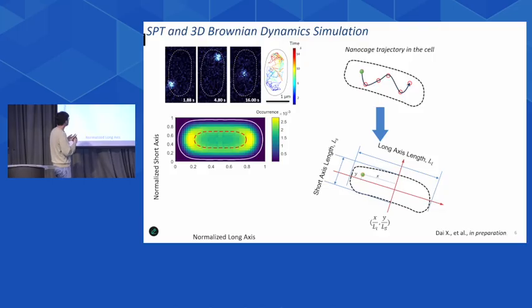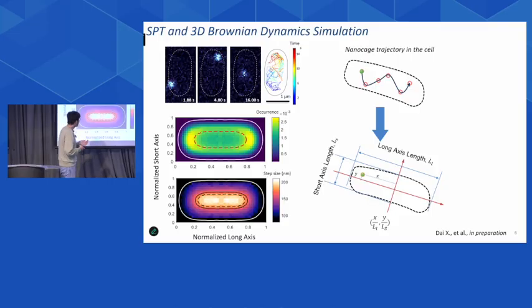So we can also use this exclusion and utilize this gradient analysis to determine the shape of the nucleoid from the heat map. And similarly, we can plot the spatial displacement map. The difference is that in this case, the color now represents the step size.